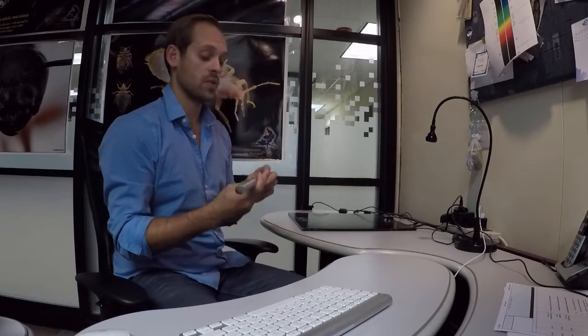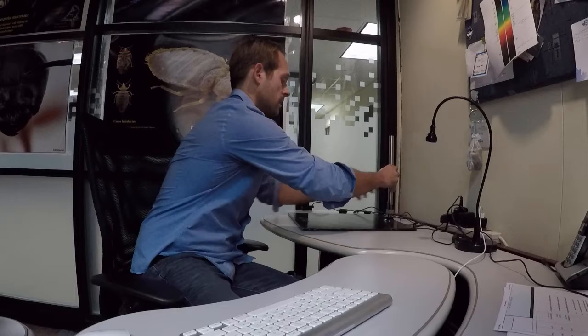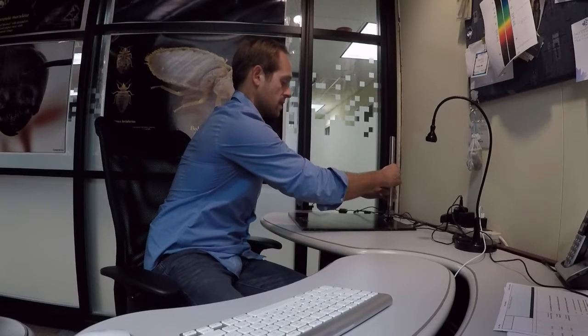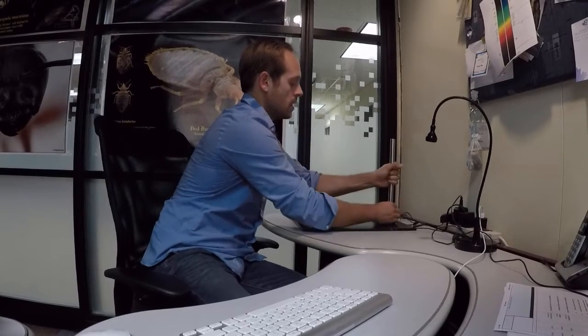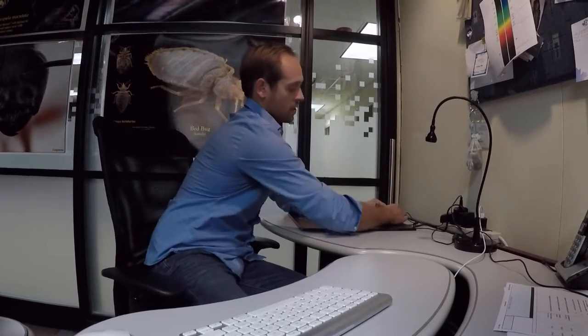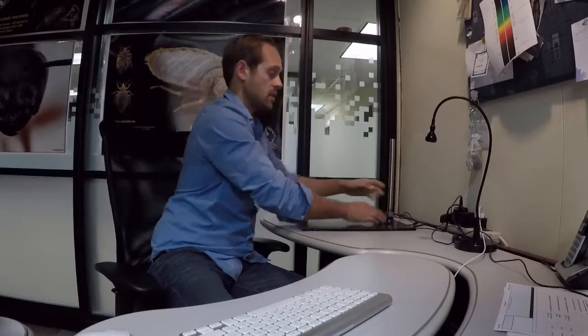To start setting up the base, take this stainless steel rod and thread it directly into the nut on the base. Once it's tight, just hand-tighten the bolt — that's all you need — and you've got a really solid base that moves basically with my whole desk.